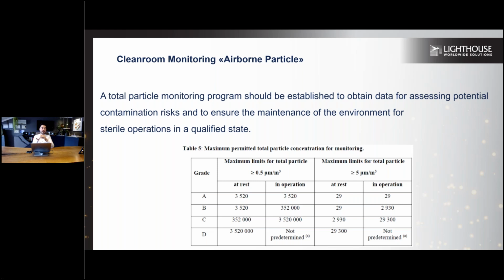And this monitoring is not limited to any specific product. Even if you are working with, for example, dust-based, powder filling lines, you should still have grade A and grade B monitoring in place. But for specific applications like powder filling, during operation, while filling, you already know that the particulate matter coming from the material itself, the product itself, can cause an issue with the particle counter. So before the process, you can run the system next to the filling point and make sure that the air you supplied is clean enough.